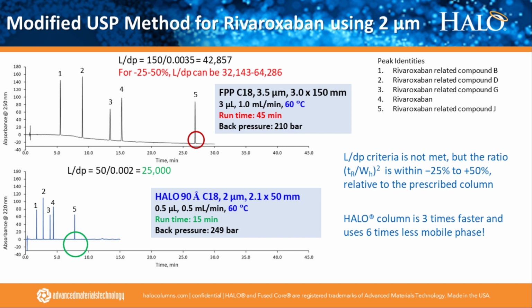So in terms of modifying methods, you can really have a lot of different options depending on what your goals are in terms of speed and solvent reduction.